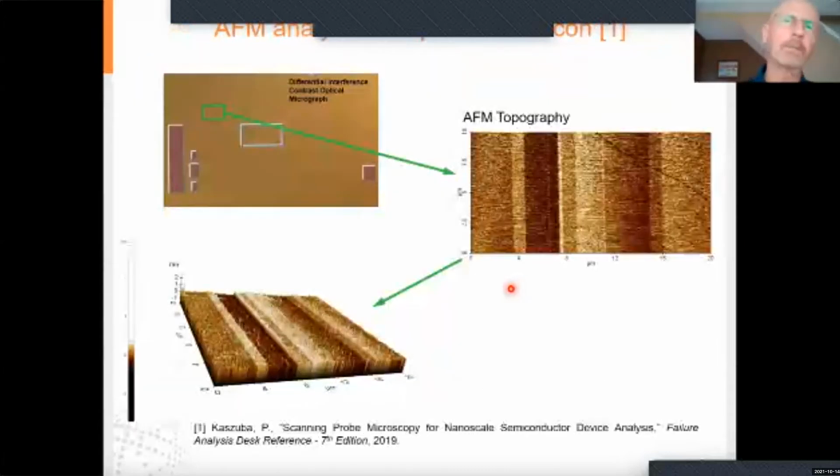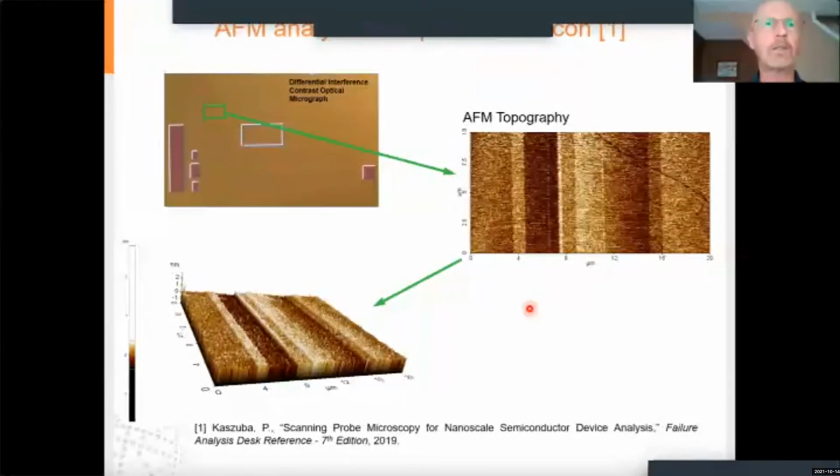Slip lines have become a problem, really prevalent, especially with silicon on insulator technology. Slip lines being dislocations which may extend on the order of microns up to millimeters in the silicon. And you can see in this optical micrograph evidence of slip lines.